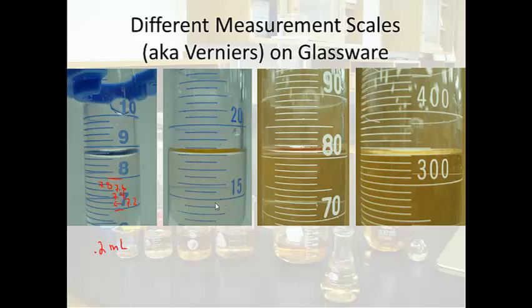This graduated cylinder is a little bit different. This is 15 here, this is 20 over here. There's several lines, there's big ones and small ones. 1, 2, 3, 4, 5, 6, 7, 8, 9 total. So I'm going to try this out. This is probably 16, 17, 18, and 19. So the big lines represent one place value of movement and these smaller lines represent a half a place value of movement. So these have changes of 0.5 milliliters.